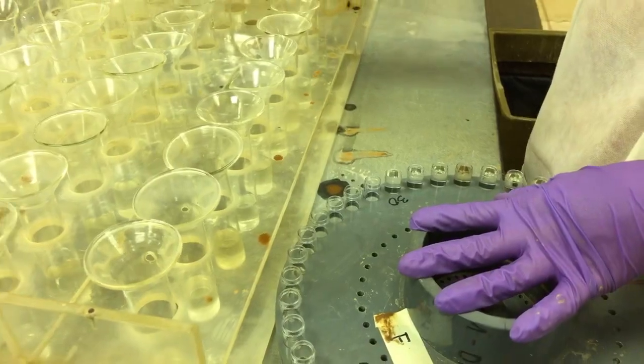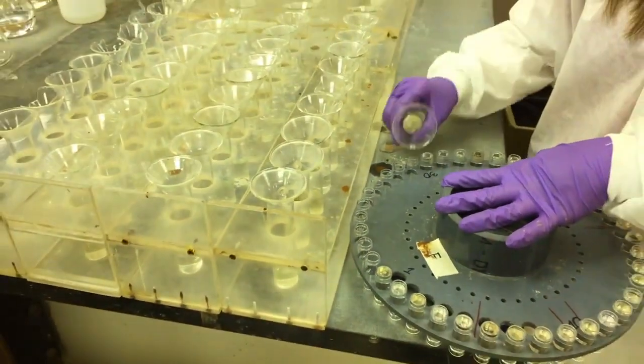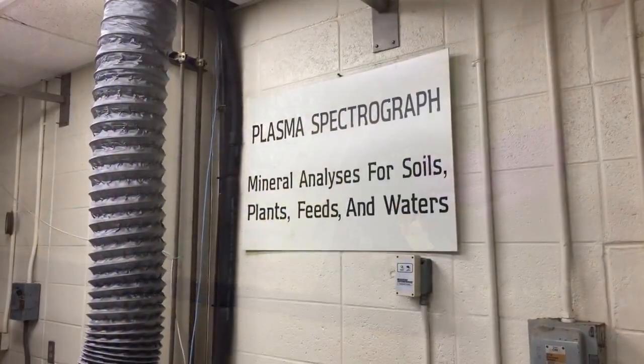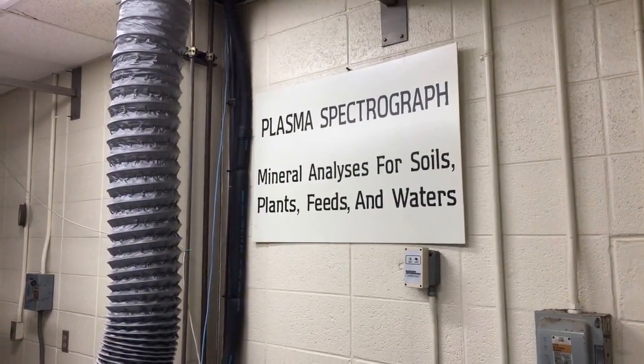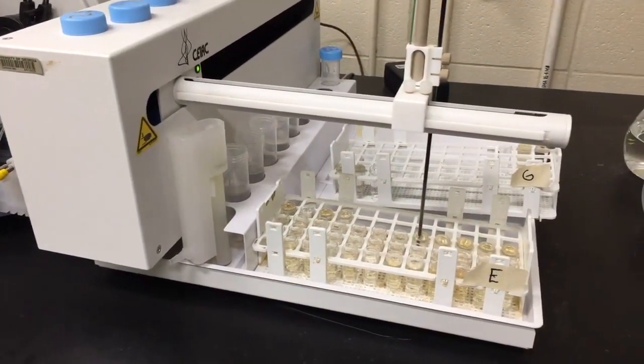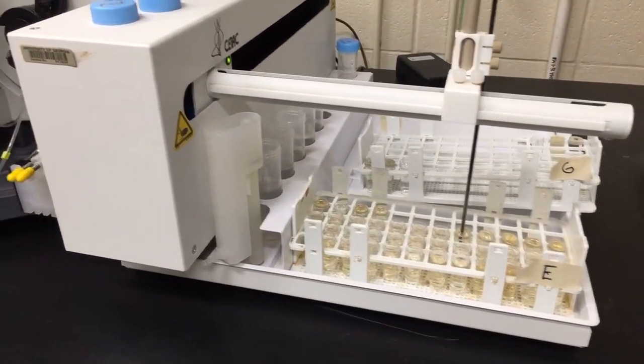Now the mineral samples have been filtered and are poured into small tubes for the final stage of testing. The plasma spectrograph is the machine that measures mineral content. The results immediately appear on a report in the lab's computer system and are sent out that day by email to the clients.